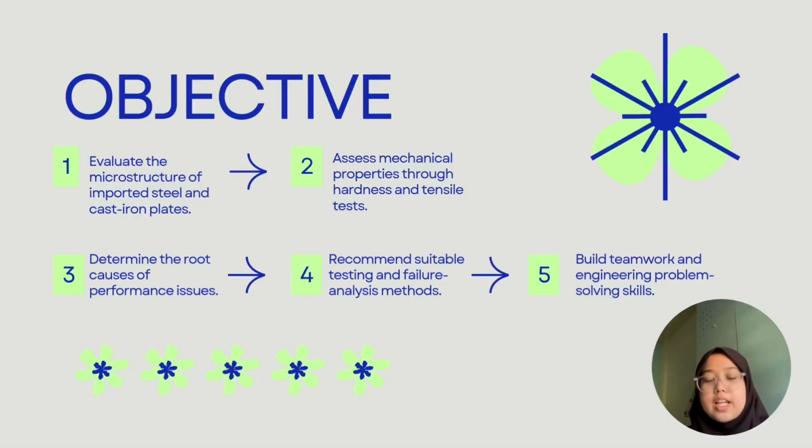These are the objectives guiding our investigation. We begin by examining the microstructure and then evaluating the mechanical properties. From this, we aim to pinpoint the reason for poor performance and develop recommendations for future quality controls. Finally, the project also helps strengthen teamwork and engineering analysis skills.